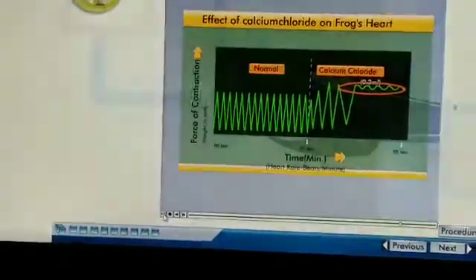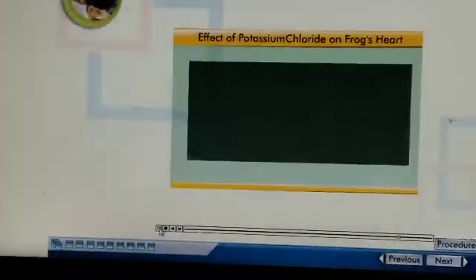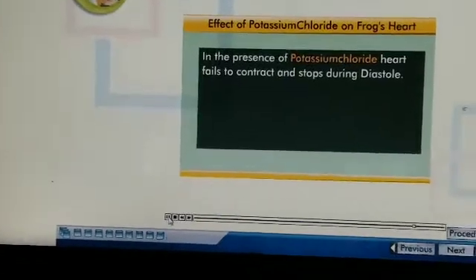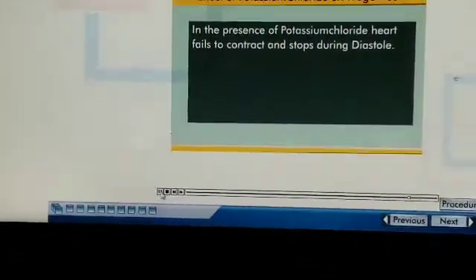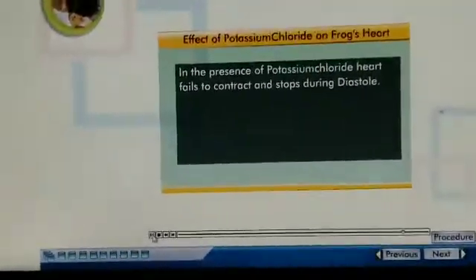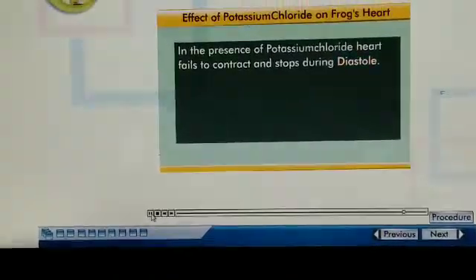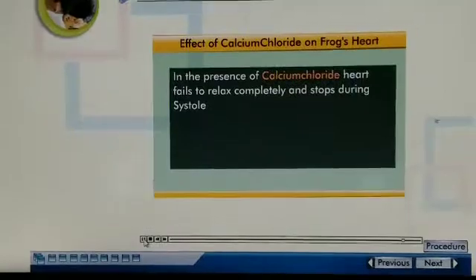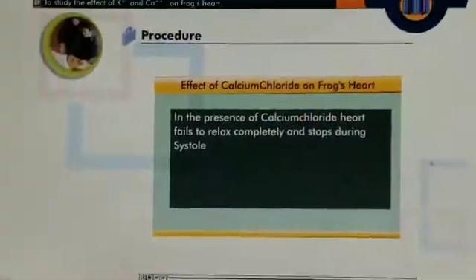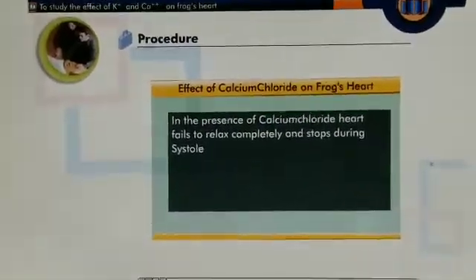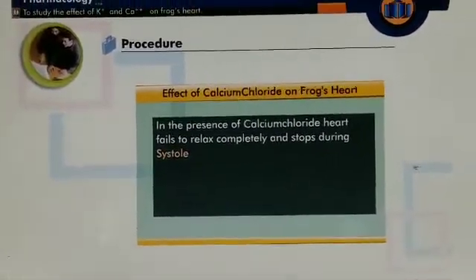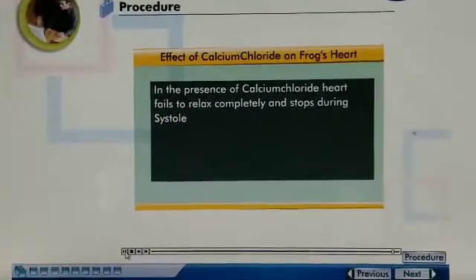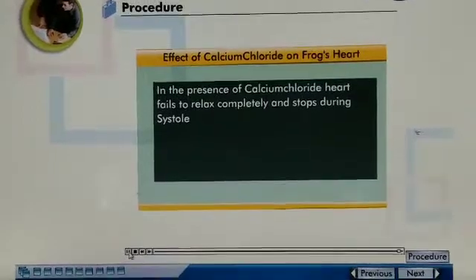From these observations, we can say that in the presence of potassium chloride, the heart fails to contract and stops during diastole. Similarly, in the presence of calcium chloride, the heart fails to relax completely and stops during systole. Clinically, potassium chloride and calcium chloride are useful in deficiency conditions.